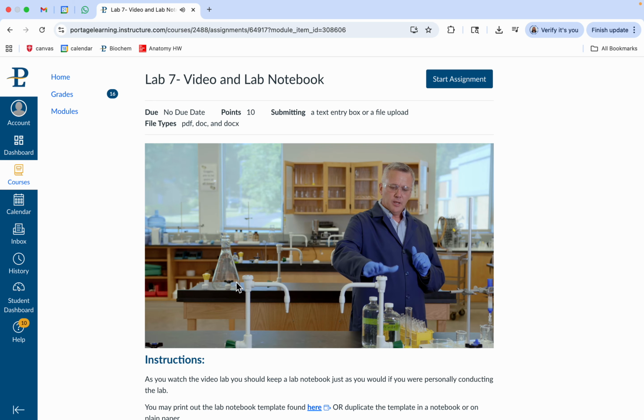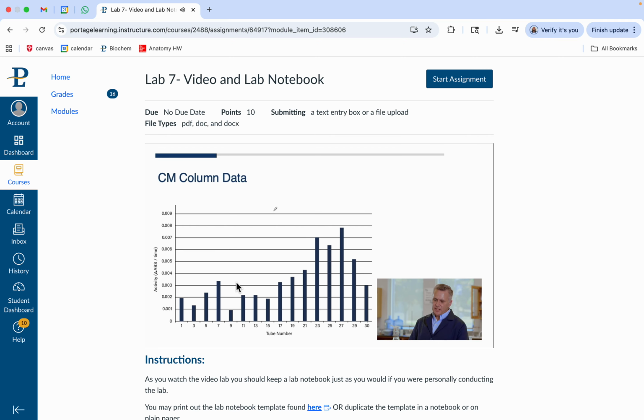Then we'll proceed with 20 milliliters of this 0.03 buffer and then 40 milliliters of the 0.08. We tested the activity in every other tube, starting with 1, right? And we got 29. We did finish up with 30. We had, again, 29 and 30 just to make sure. But it really appears as if this is probably our high point.